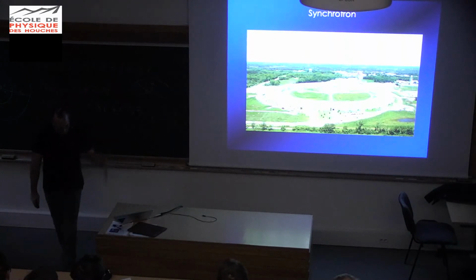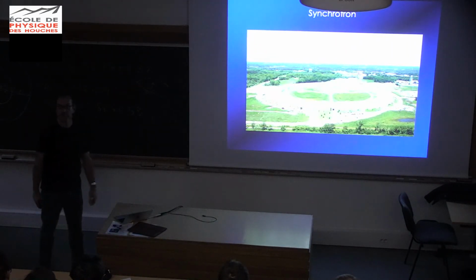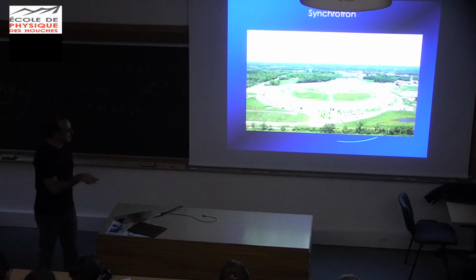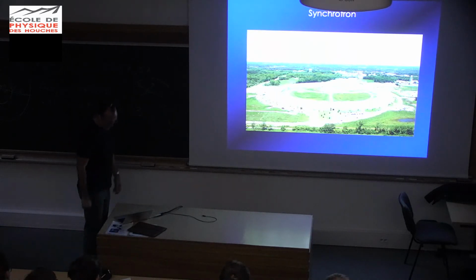So the main tool for in situ analysis is the synchrotron. You all heard of synchrotrons? You hear of us going, oh, these guys are going to the synchrotron. Okay, this is the synchrotron. It's this big old machine, crazy environment. I hate it, but you can do a lot of things there.